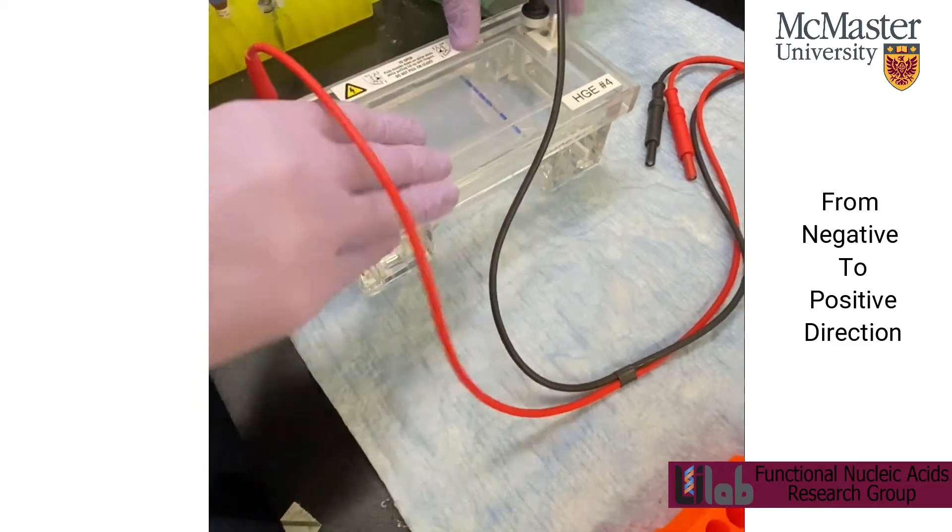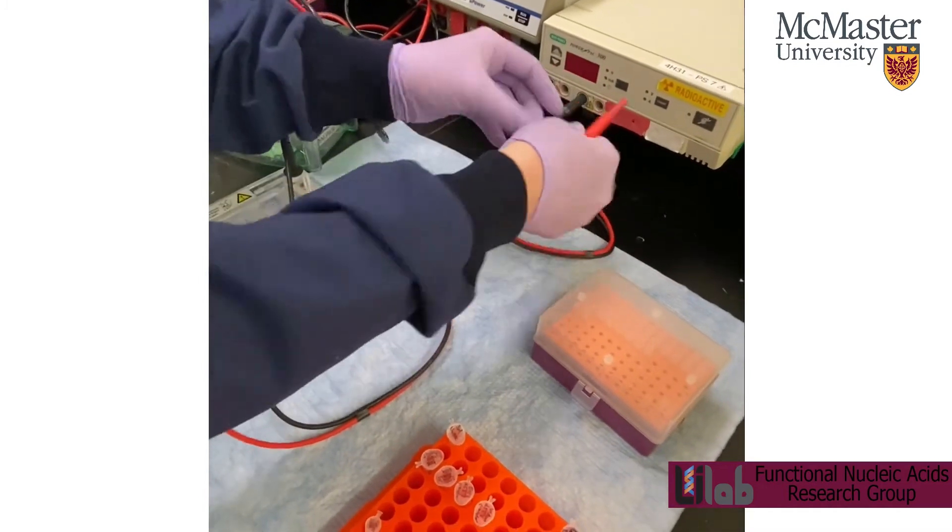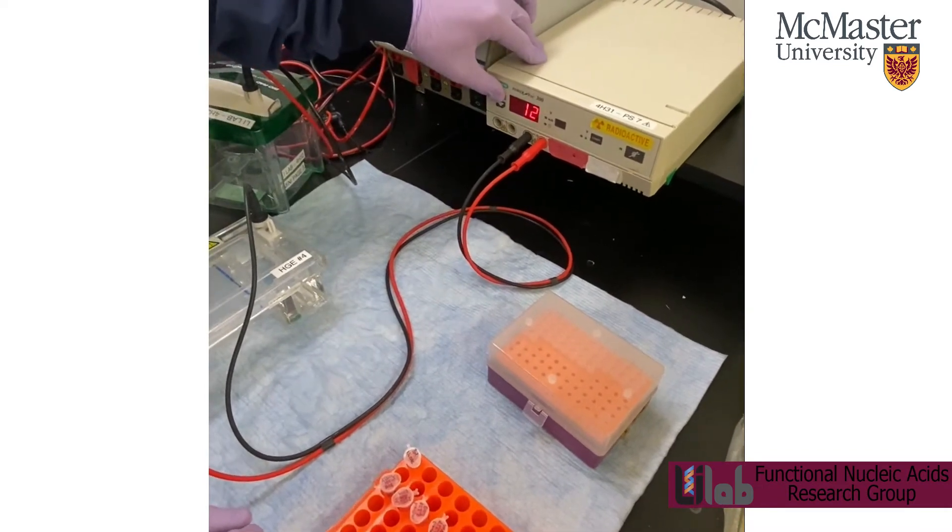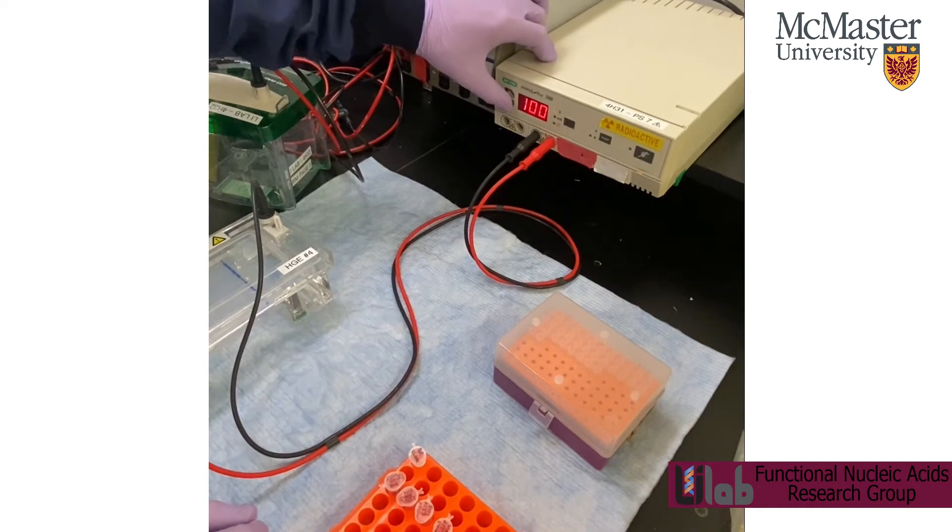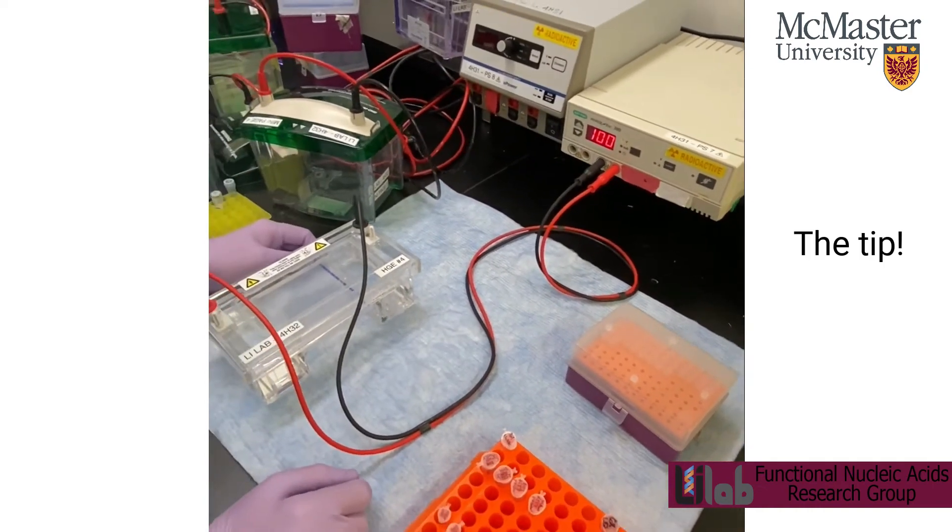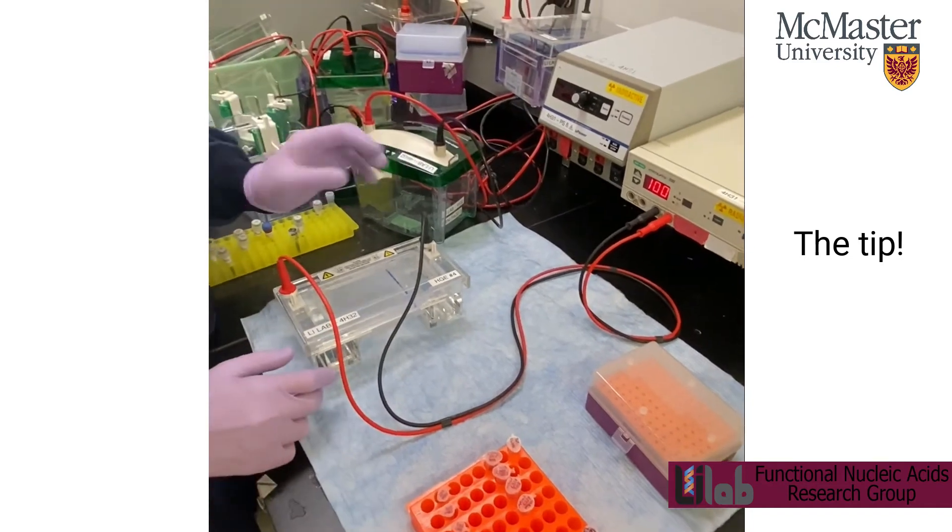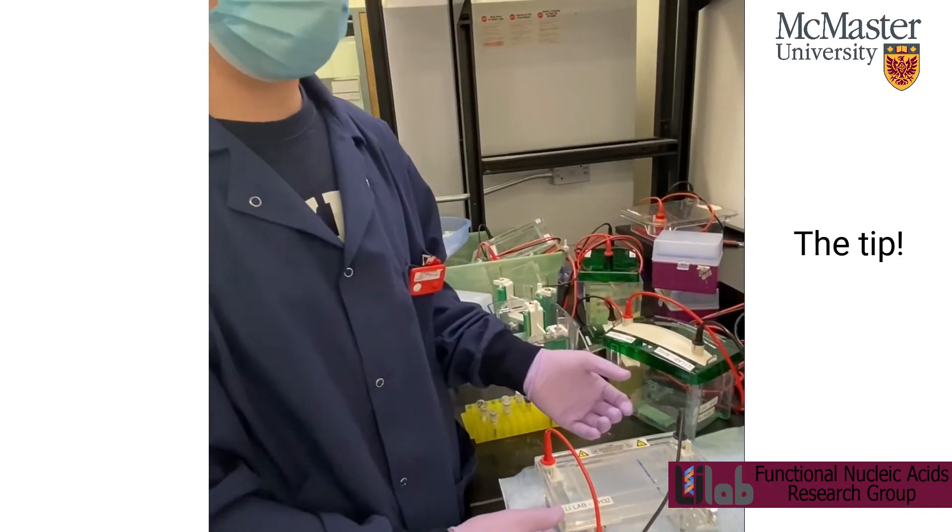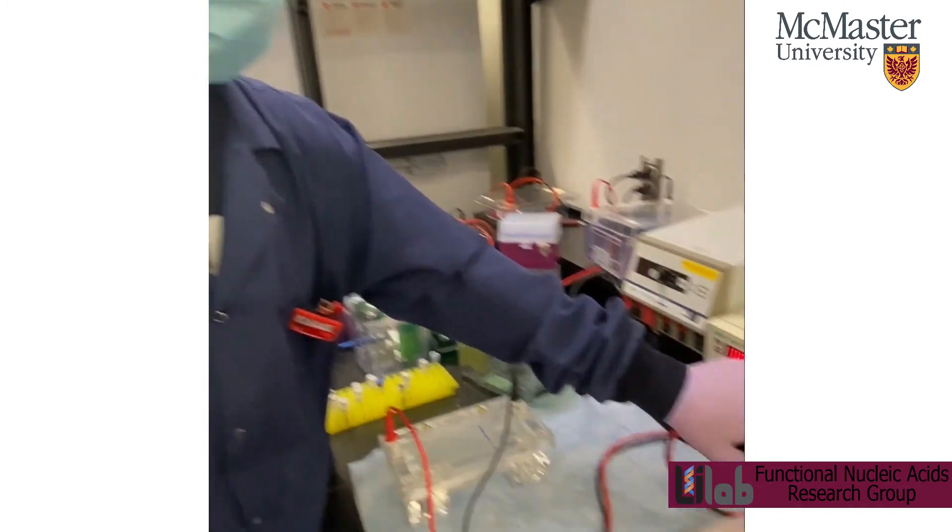So close the lid. And then plug the leads in. Make sure they're in all the way. And then I'm going to set the voltage to 100. Usually between 90 and 100 is a good range. The higher the voltage though, the hotter it's going to get. So you don't want your gel to melt in the apparatus. And then you can just run it.